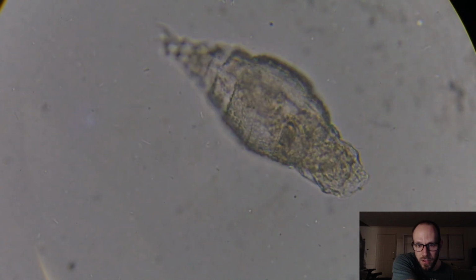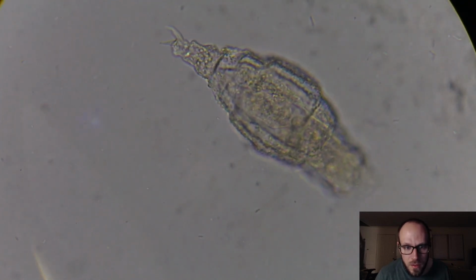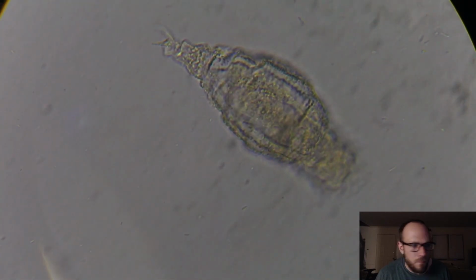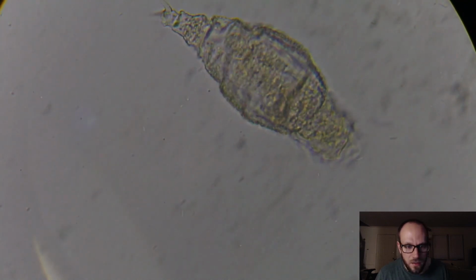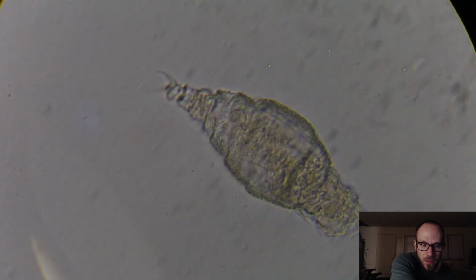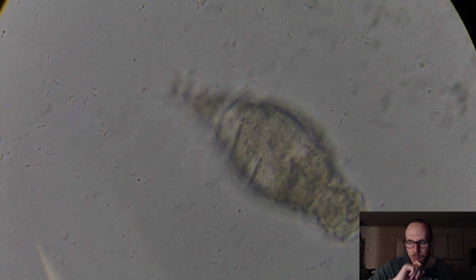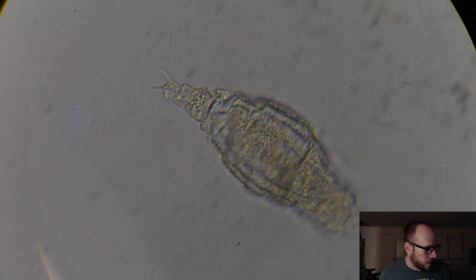You can't really see much of its digestive tract. Let me try and get some more contrast here if possible. I'm going to slightly obscure the light with the filter and then turn it up a little bit. Yeah, it's not offering me much. So I'm thinking that this sample, that whole red water thing, ended up in some kind of calamitous effect. And again, we're seeing all these bacteria. I'm thinking that the bacteria overproduced and the other life couldn't keep up with it. So that water might just be super duper filled with bacteria, which is a little bit dangerous.